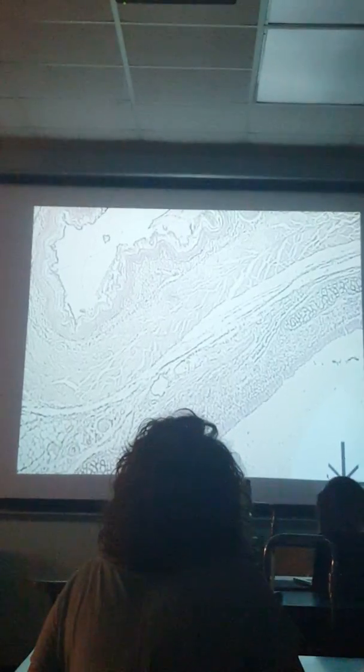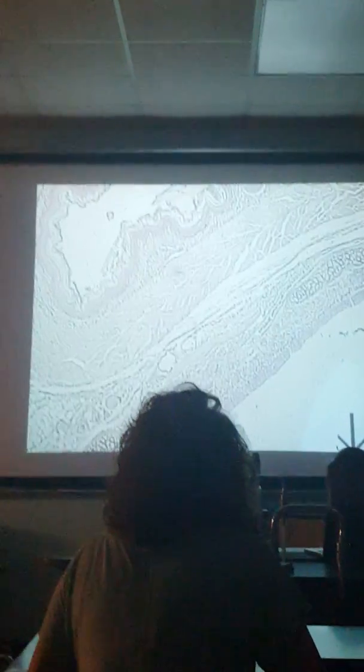Stratified squamous. So take note of that. But I don't know where in the esophagus this is. So I don't know if it's mostly smooth or mostly skeletal, because it doesn't say where the section was taken. So I can't ask you that question on the exam.